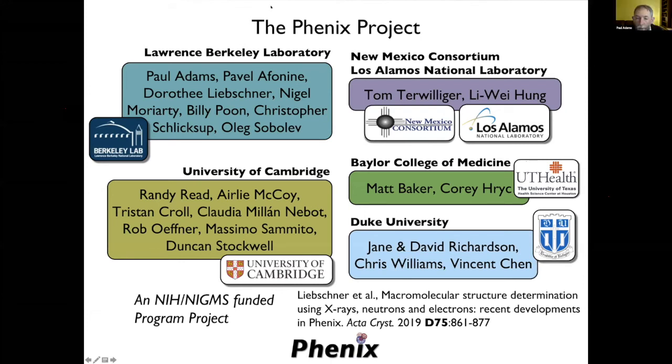Yeah, there's a related question. At which point is it better to run TLS parameterization? Towards the end of refinement, that's for sure. Again, that's because conceptually, if you do TLS parameterization, you introduce more parameters, and you don't want to introduce more parameters early on because your model is not great enough at that point. That's the idea.